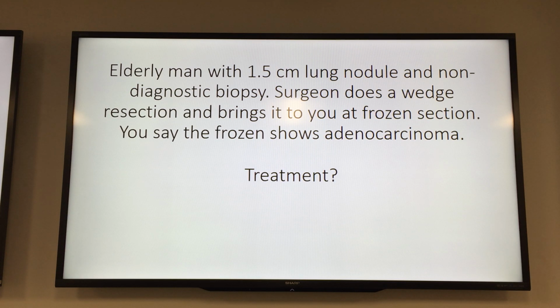So let me explain to you like this. Let's say this thing is the wedge, the cap of the bottle, okay? This is the bronchial margin connected to the rest of the body. Now they said, what is this lesion? You say adenocarcinoma. Then you say, okay, the whole bottle is coming out. What's the true margin? Is the edge of this the margin? No. So it doesn't matter. You inked it, you did a good job and inked it, but that's not the true margin.